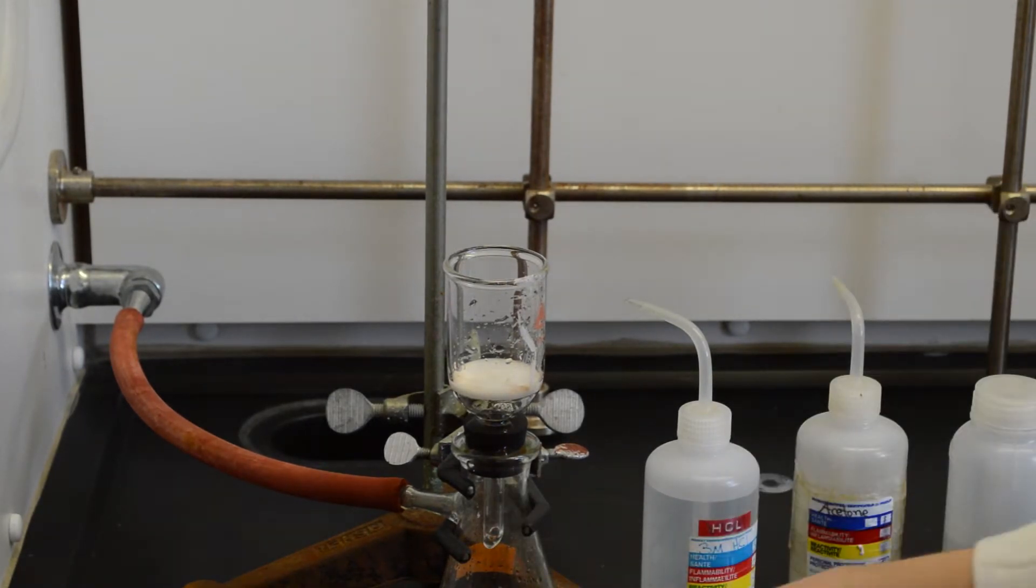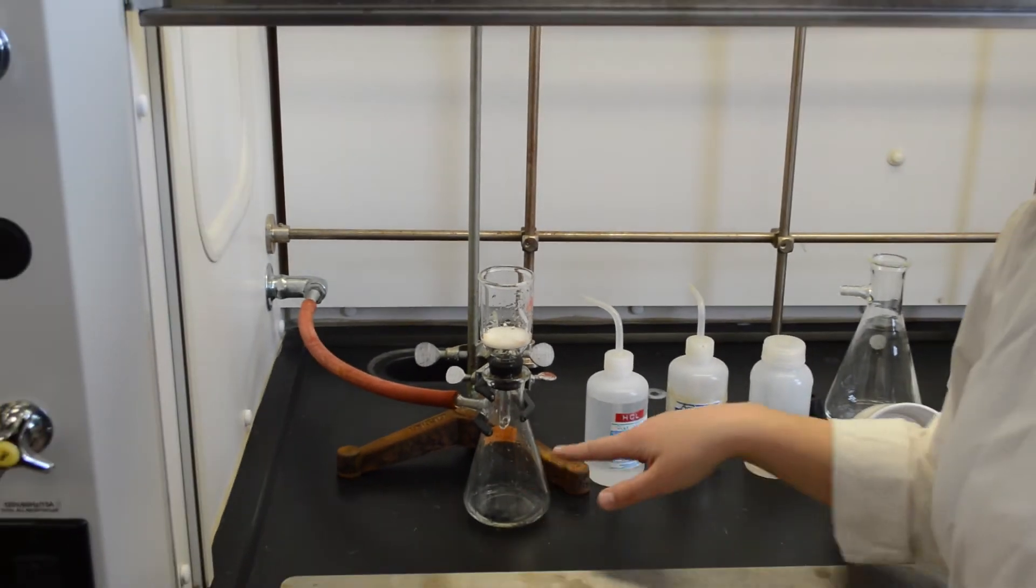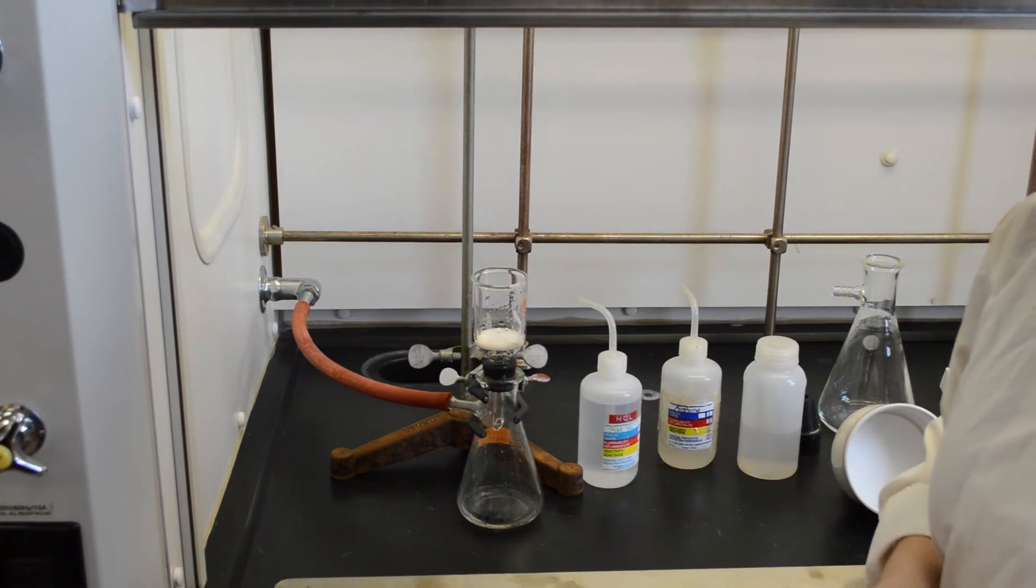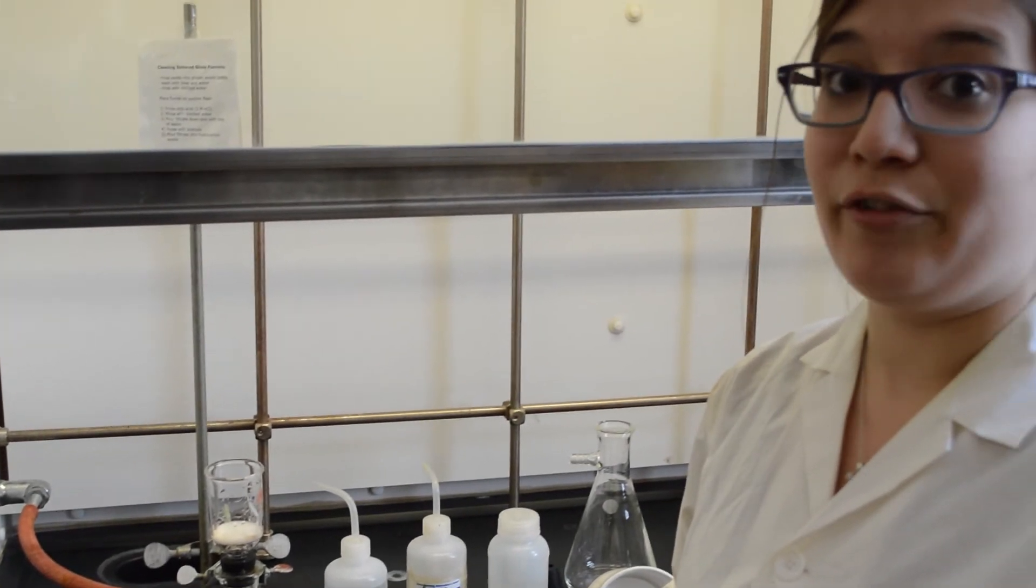At this point you have to take all of your acid waste and dispose of it in the appropriate acid waste bottle. And then you can give the sintered glass funnel a final rinse with some acetone. It's important to make sure that hydrocarbon waste such as acetone and acid waste never mix.